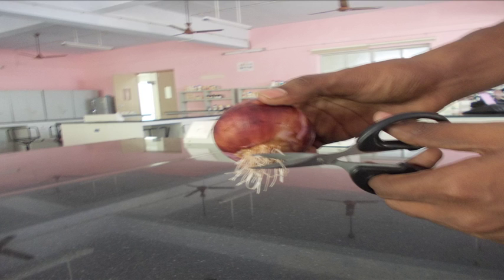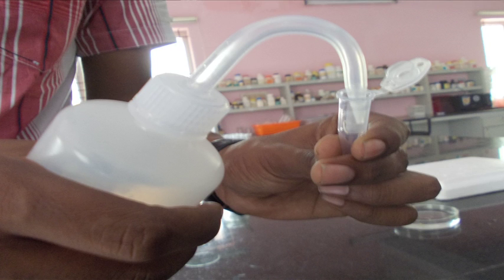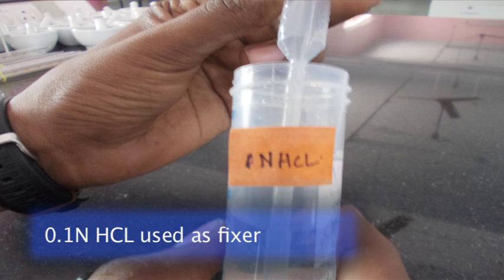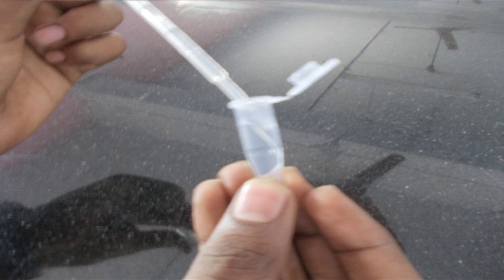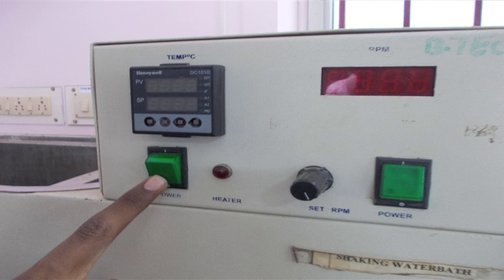Using scissors, take a newly sprouted root and place it in the Eppendorf tube. Using the forceps, clean the root tip using distilled water. Add one drop HCL into the tube using the dropper. Close the tube and place it in a floater and keep it incubated in a 60 degree Celsius water bath for 12 minutes.